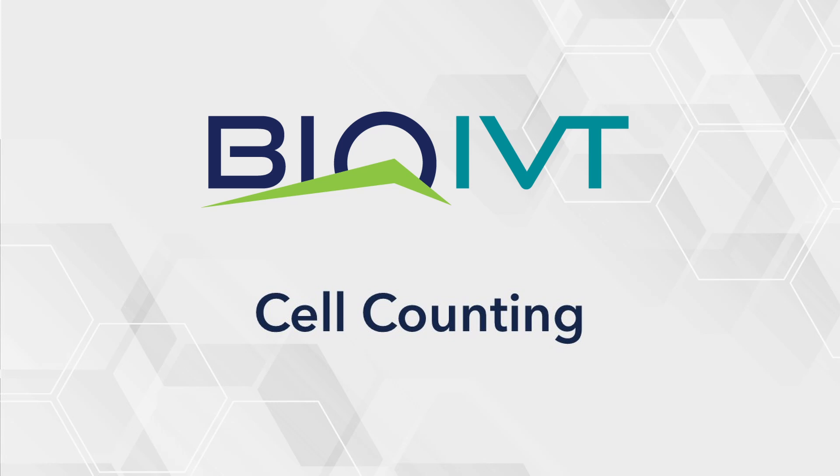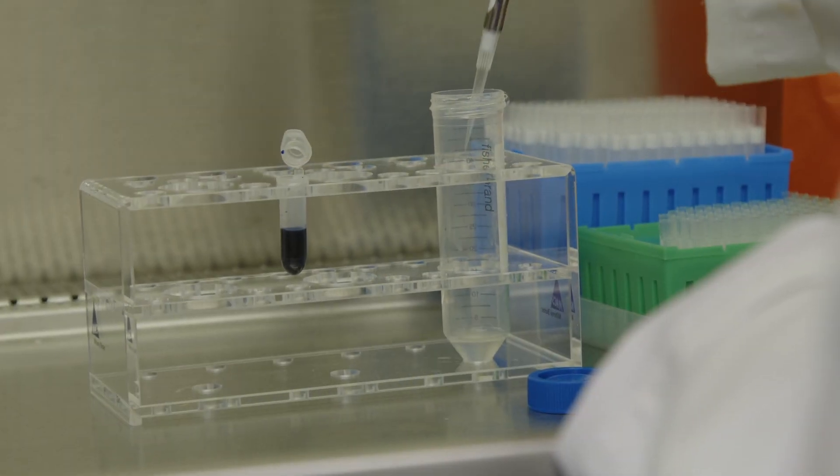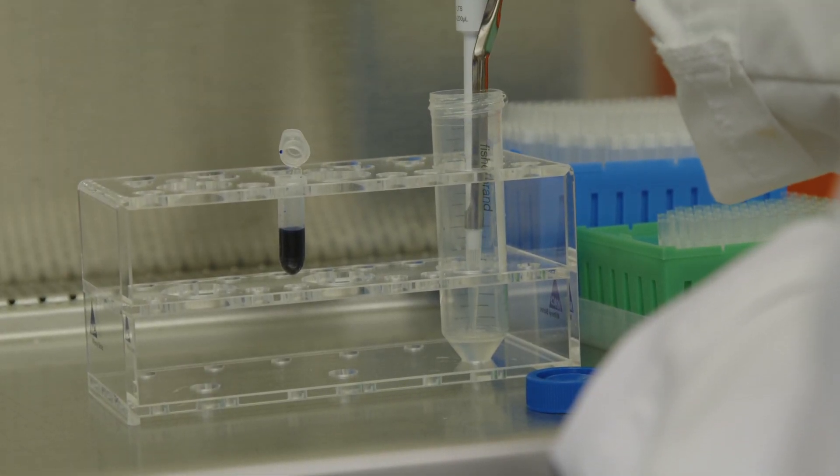This video provides instructions on how to count cells using the trypan blue exclusion method. When handling cells, use aseptic sterile techniques. The cells need to be diluted at a 1 to 10 ratio using the following formula: seven parts medium or buffer, two parts trypan blue, and one part cells taken from the 50 millimeter conical tube.